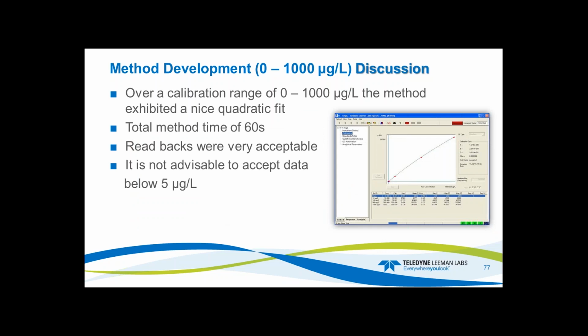My total method time was only 60 seconds. That is race-ship fast. That is really, really a speedy method for this type of calibration and the concentrations I'm using. Readbacks are very acceptable. It's not advisable to accept data below 1 or below 5 ppb.